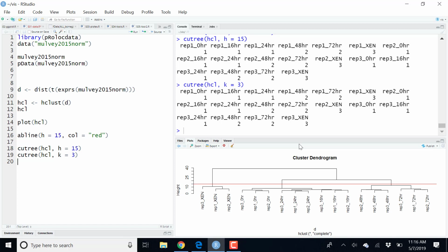Okay, so a little exercise for you. You could do it using the same data set. If you have another one, feel free to use another one. What would be the clustering that I would get if I wanted to have 5 clusters? How could I find, based on this hierarchical clustering, the 5 possible clusters to identify?